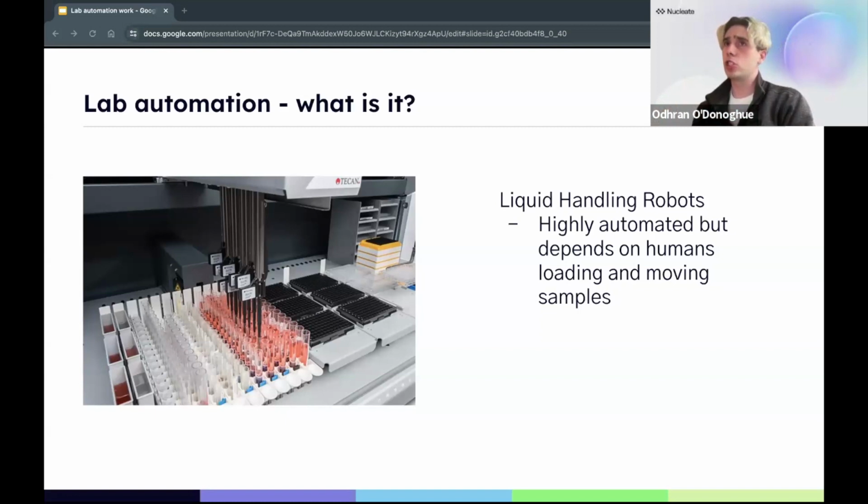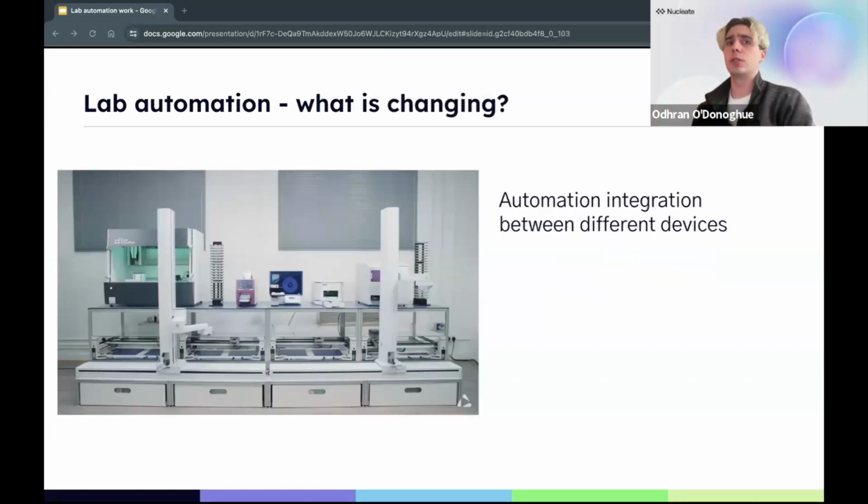So what's changing? In the last few years, we have seen startups begin to adopt these ideas of trying to integrate different bits of the lab together. There are things like Automata, that's one example, Emerald Cloud Labs, which I'll come back to in more depth later. But all these companies are trying to say, okay, this thing is automatic, this thing's not automatic, another thing is automatic. We can kind of glue these things together. This is a good example here. This is an automated system running a plate reader between different other devices and a liquid handler.